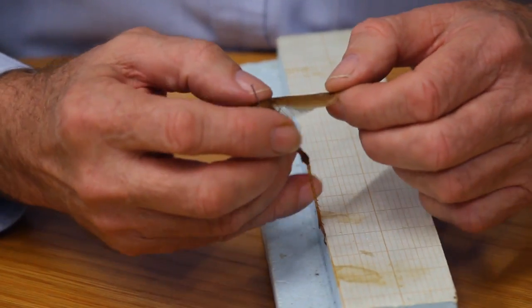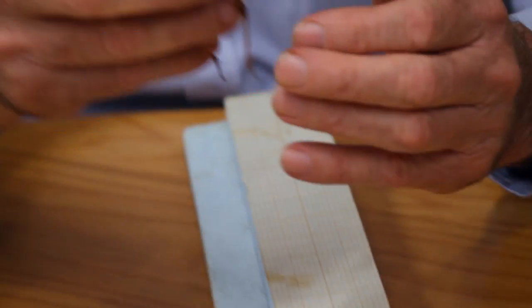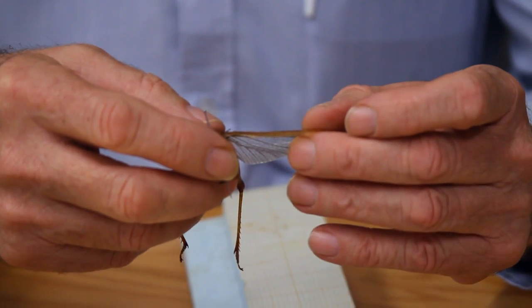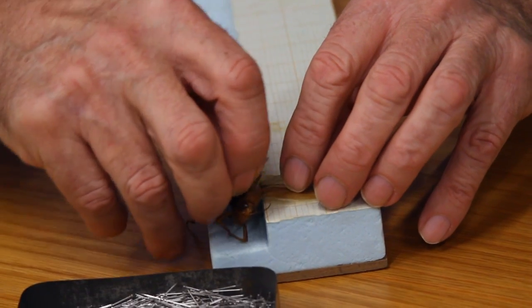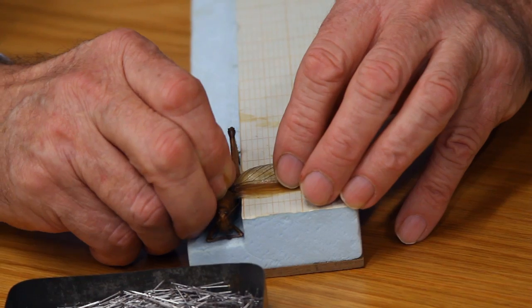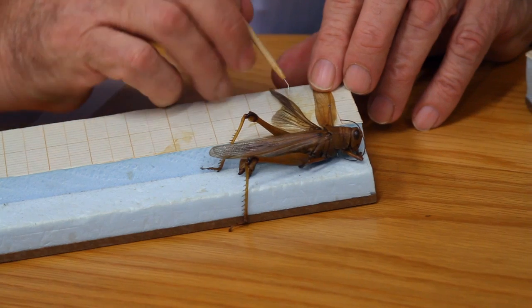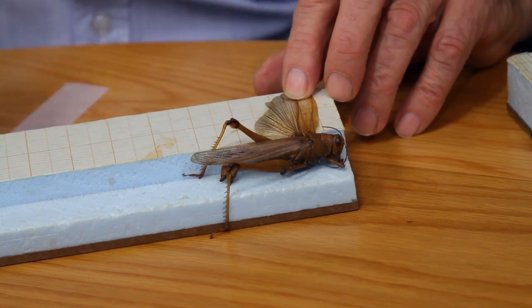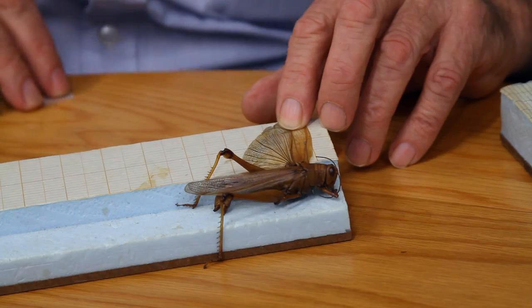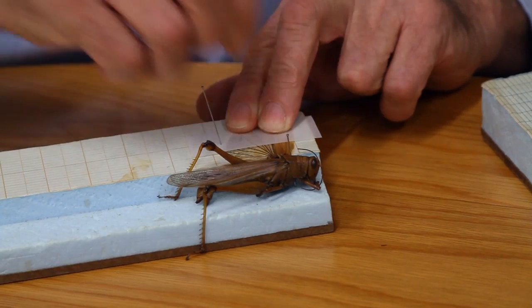I usually pull the wings out first because this board is very different to most boards — it has a groove down the centre. We only want to pin one side of the grasshopper's wings. We place the wings near enough to where they're going to go and then push the pin in. We then get a piece of tracing paper and pull the wings around so they're approximately 90 degrees to the body, making sure the wing is properly spread so we can see the venation — that's important also for identification. Secure the wings.